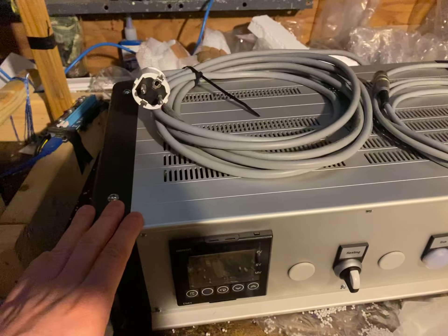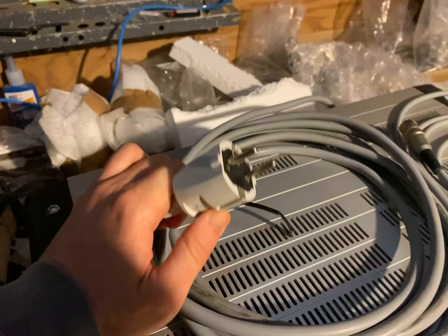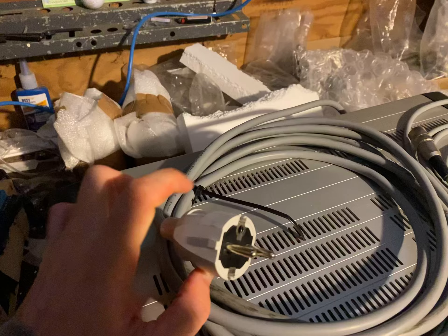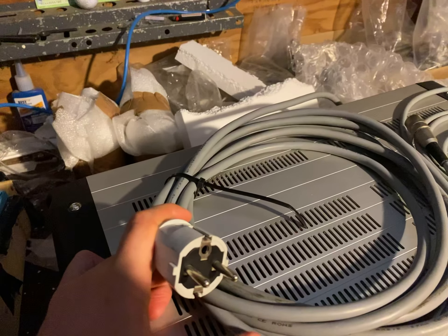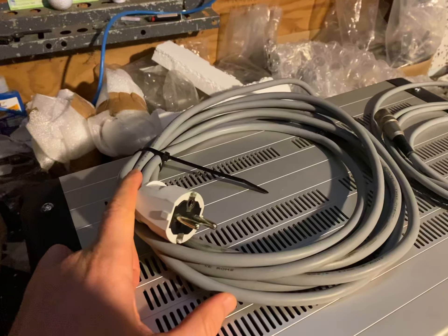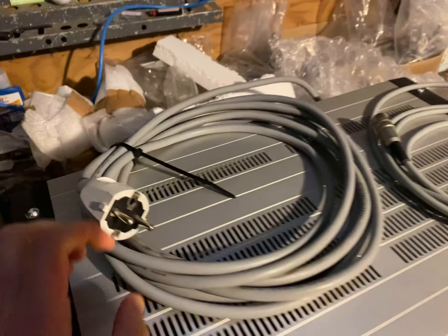Coming out of the control box there are three wires. One is the power cord — this is a 240-volt power cord. We have the specs on the plugs; basically this is exactly what you would use for a refrigerator or home appliance somewhere in Europe. That's the type of plug we have on there.